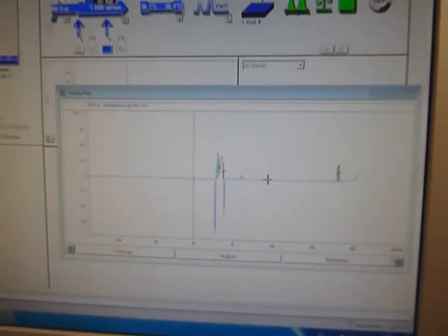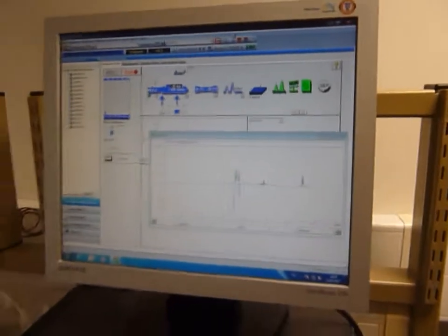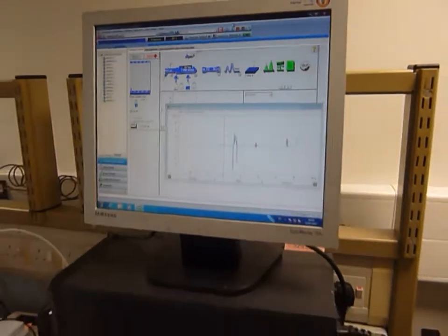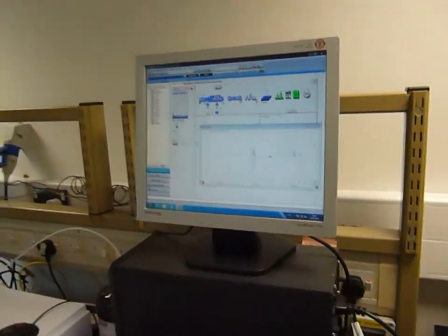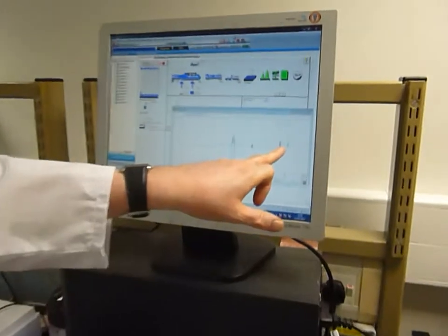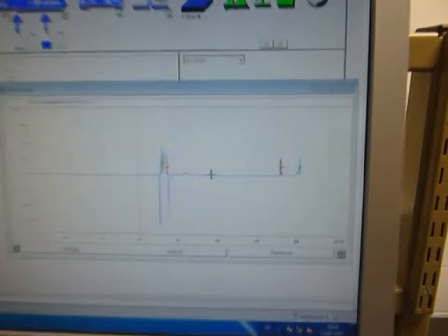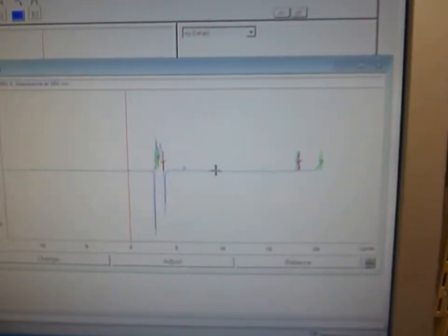The system uses very easily programmable software. And you can see there, it's a good example here, where the fraction's now being collected.